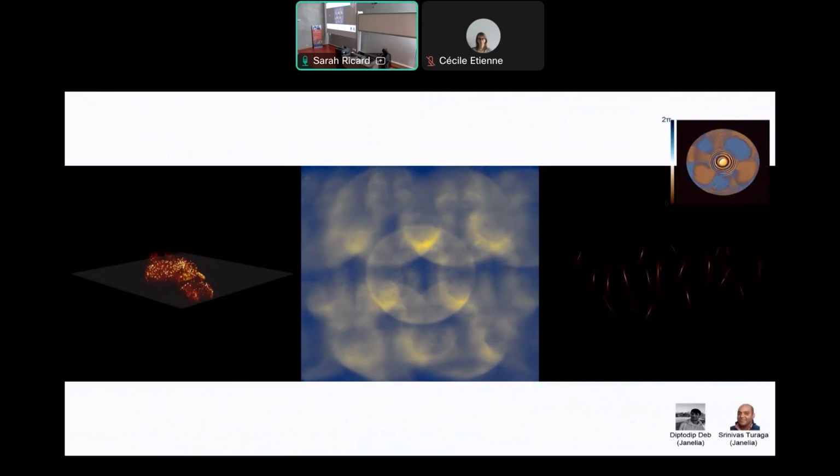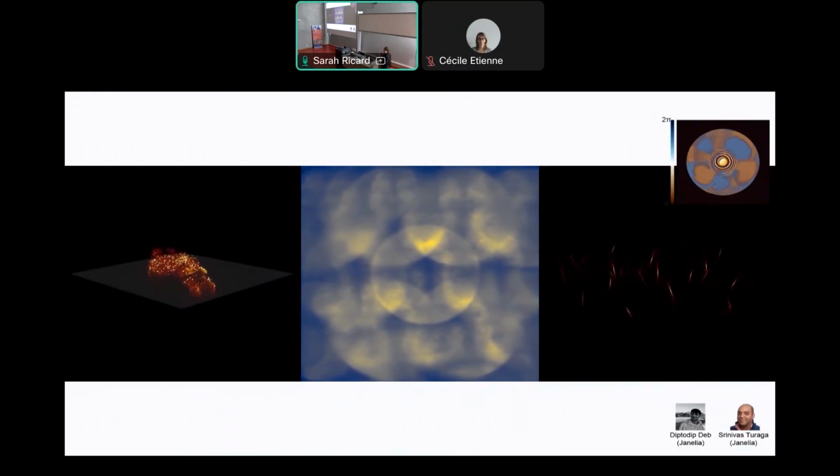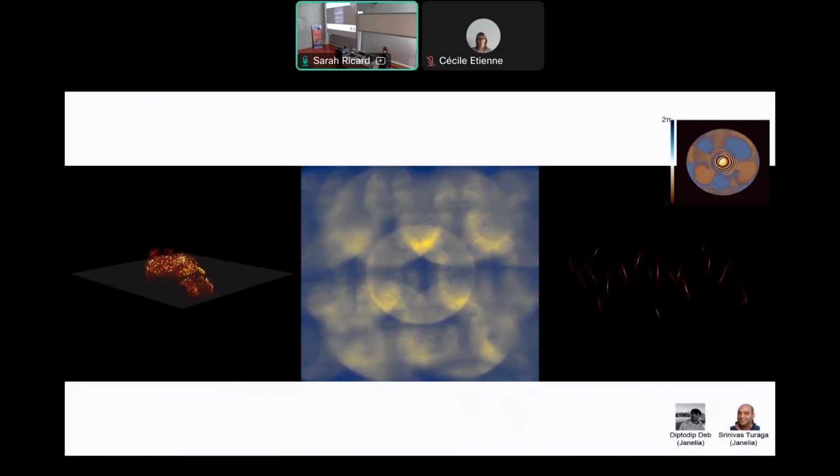So this is the image that I've recorded on my camera. That's what I was saying: it looks like absolute trash, right? Usually when you look into a microscope, you would hope to see the sample. But with these techniques, what you're getting is not that at all. You have to do some computational reconstruction in order to get back to it.